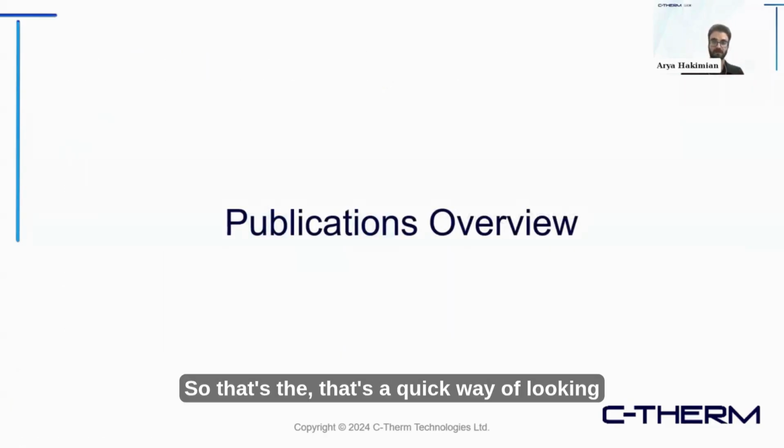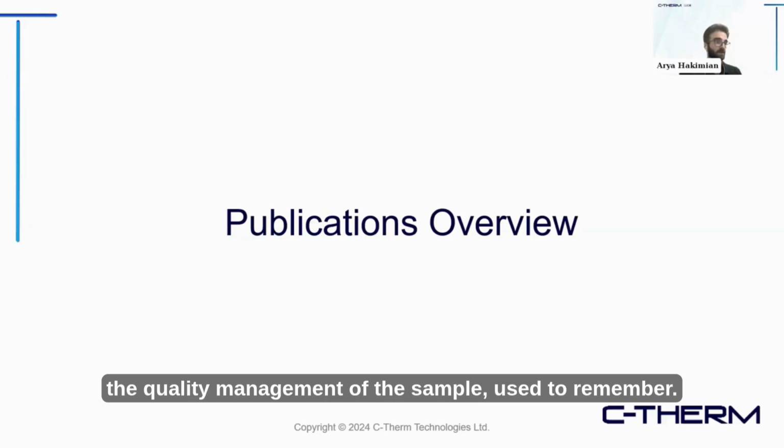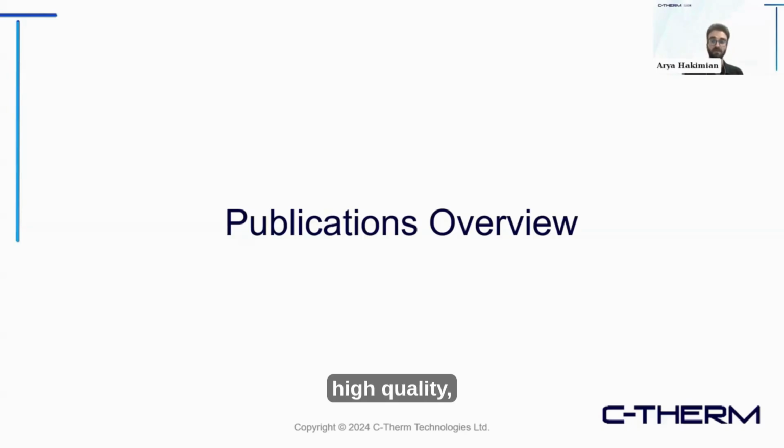So that was a little bit of, I'd say, a run through on some of the methods and a few example data sets. But going into the final portion of today's presentation, wanted to do a little bit of an overview of some publications that have made use of the various methods that we have available on the Trident platform.